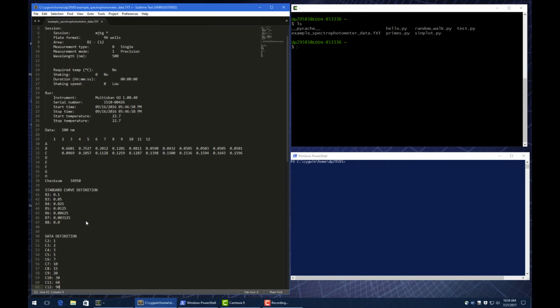So I actually have all the data from 1 to 90 minutes. You guys should have something very similar for your plate reader. But this lets the user tell somebody somehow that that's what all this data actually means. So I'm going to go ahead and save this file. And then when we process it in Python, we can get the meaning of what it actually is.